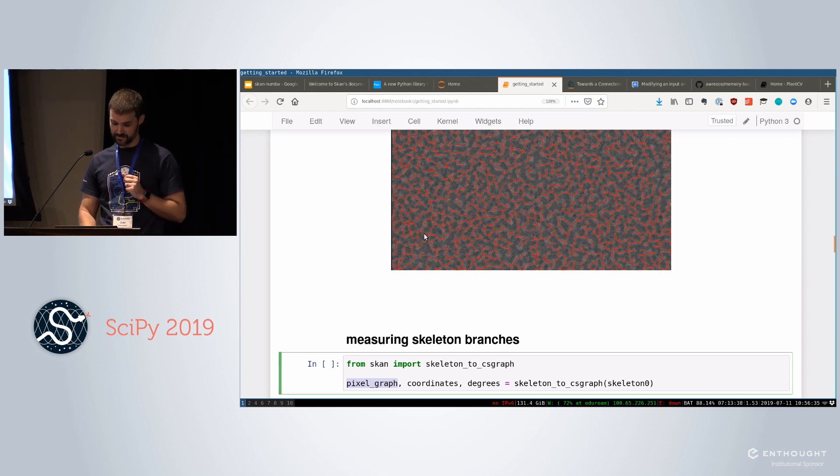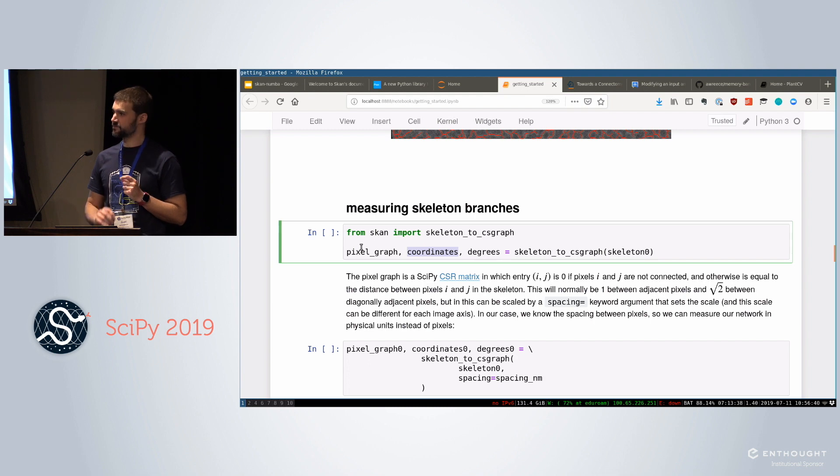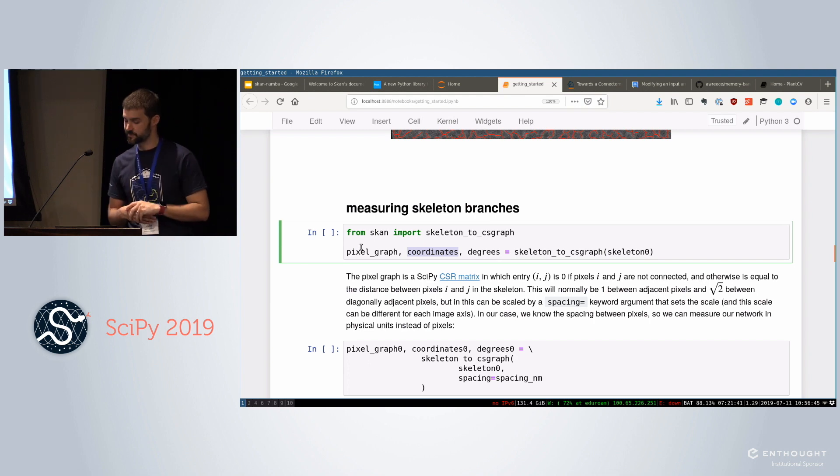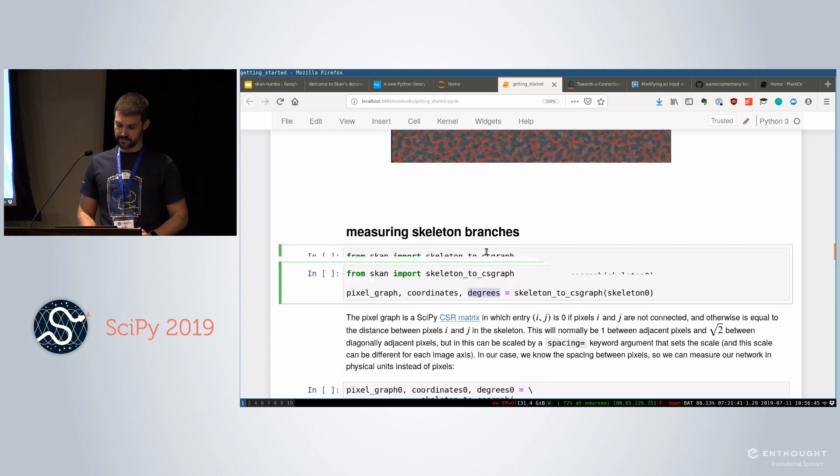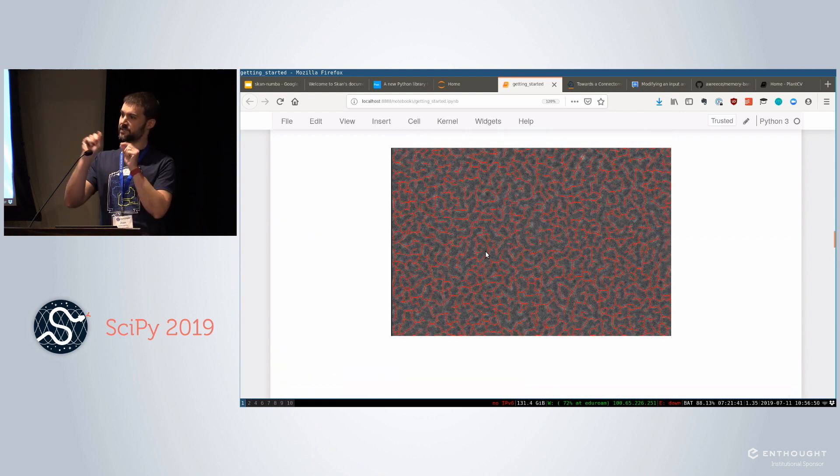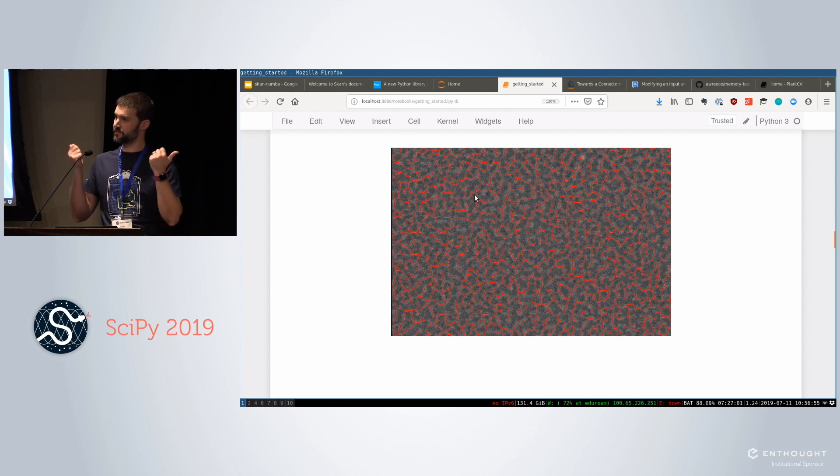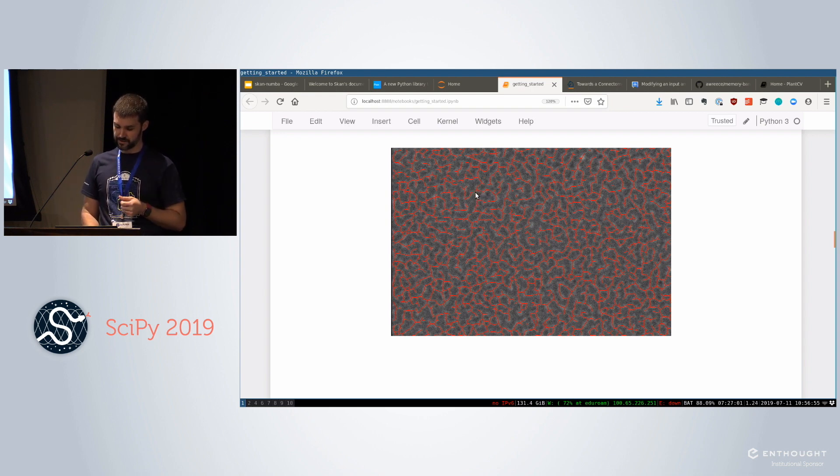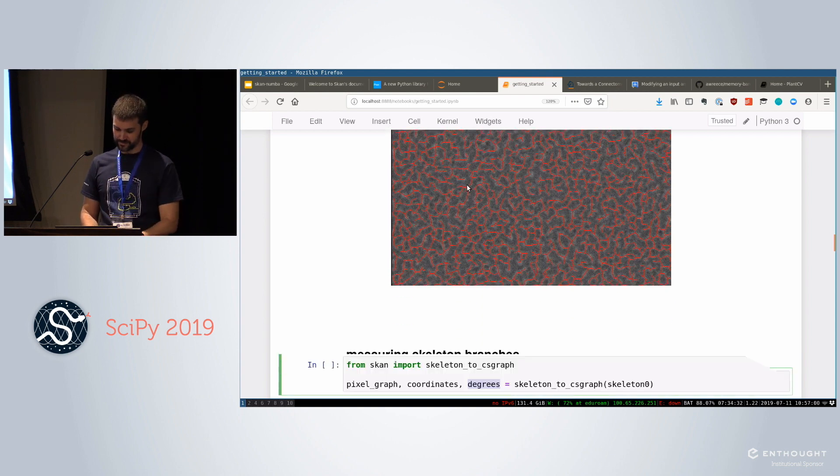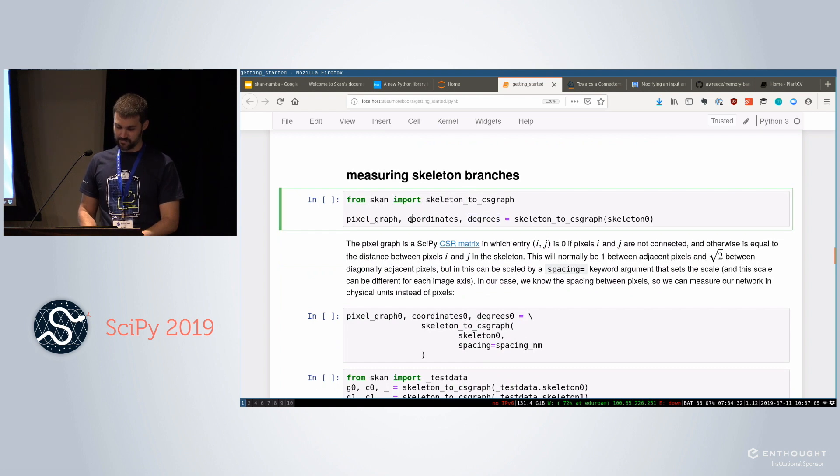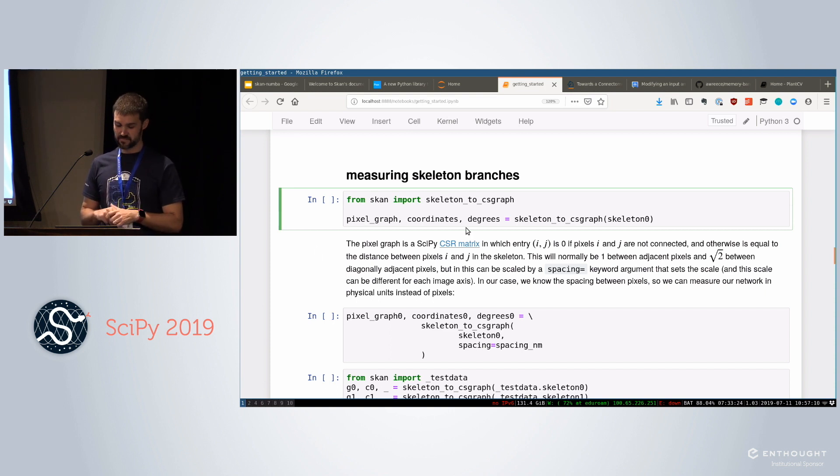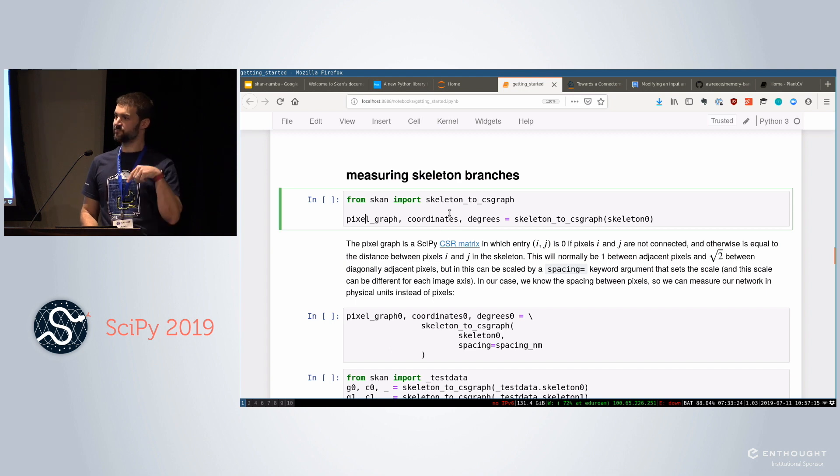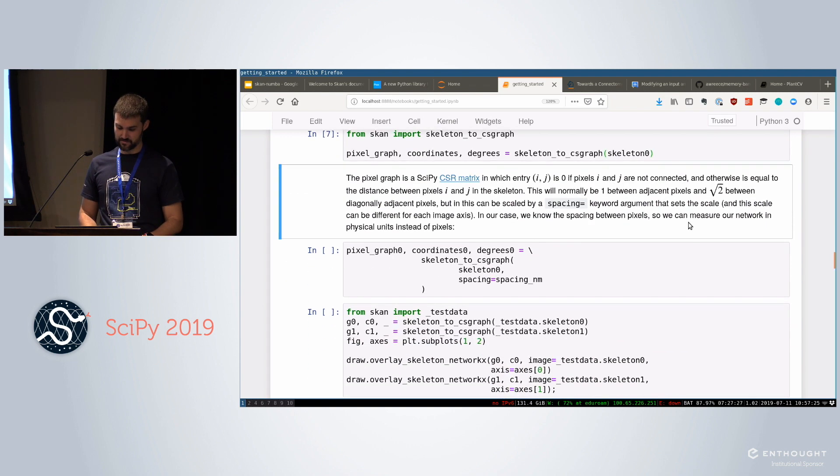And what it returns is this pixel graph, which tells me which pixels are connected to which other pixels. So it builds a network out of these branches. Coordinates, which tells me for every pixel in this graph, where is it located in real space. And degrees, which is the number of pixels that it's connected to because that tells us whether a pixel is part of a path, because it would have degree two, only one neighbor to each side, or part of a junction, or part of a tip. And these are all things that you're interested in if you're looking at the topology of the skeleton.